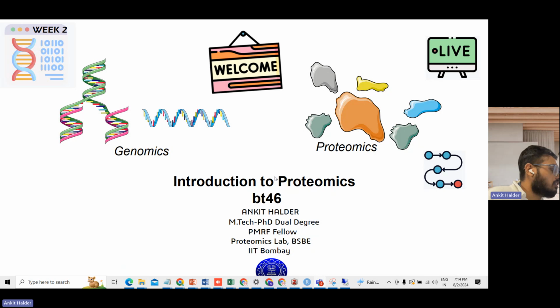I am hoping that all of you have gone through the lecture on sample preparation techniques, the challenges for different sample preparations, and interfering agents from other biomolecules and chemicals present in a particular sample. Then we will look into protein quantification methods. We would like to solve some problems regarding how to estimate the unknown concentration of samples through the different methods that we can generally use.